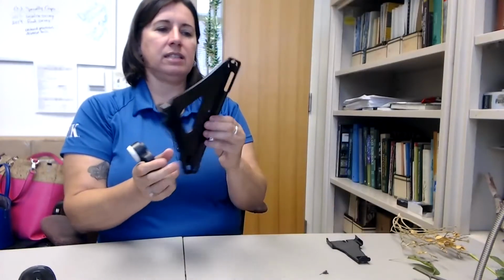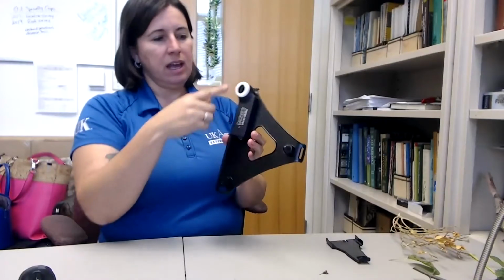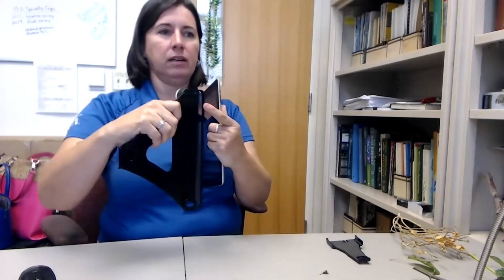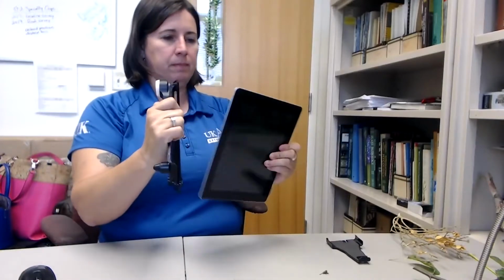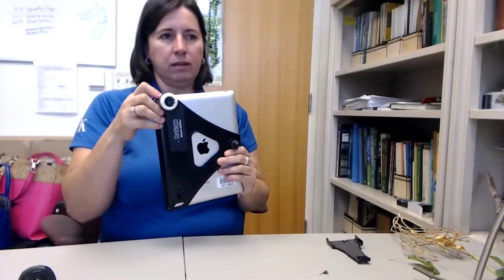This one is the cell phone one, I'm sorry. And this one is the iPad. I like to use the iPad. If you ever see me around training, I will use the iPad. So it's got two feet, and then the ProScope serves as the other. My iPad camera is going to align with the ProScope, and there it clips on this way.